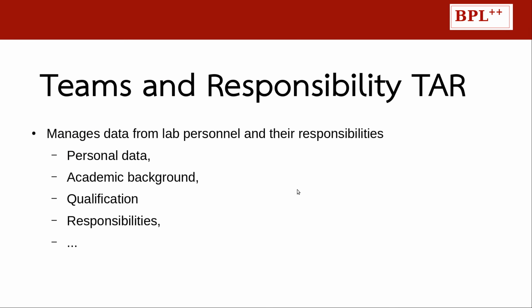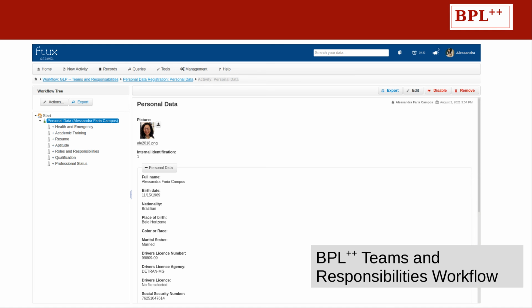The teams and responsibility workflow assists in the management of data from laboratory personnel and their responsibilities. It includes information on laboratory teams such as personal data, academic background, etc., as shown before. And here is a screenshot of the teams and responsibility workflow, where we can see the activities that relate to the workflow that has been shown.